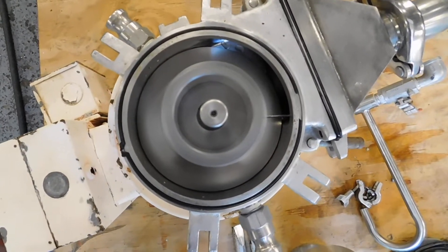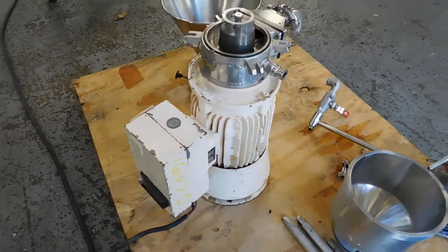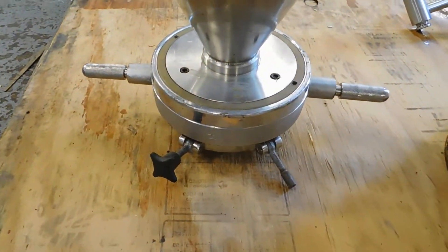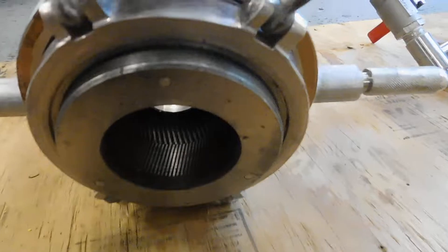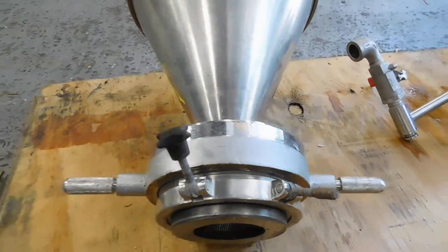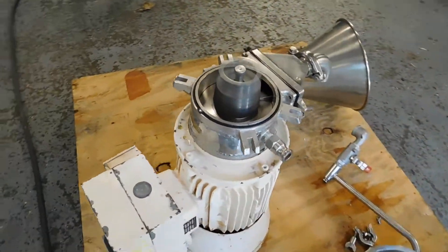Perfect — nice, quiet, smooth operation. It has a mainly adjustable gap for the rotor and stator. You can see here's the top of the unit, and of course it has a matching stator inside the unit, as you can see in there. By rotating up and down on the threaded fixture, you're able to adjust the gap between the moving rotor.